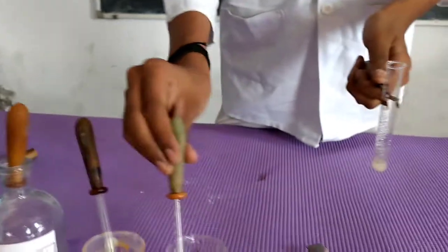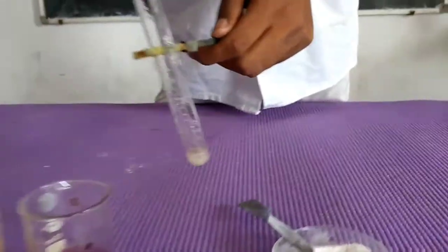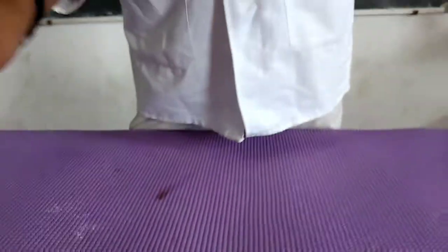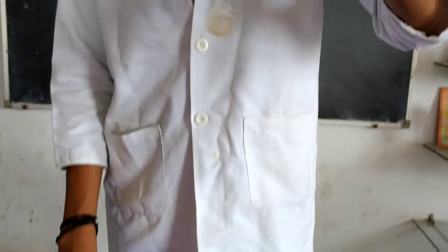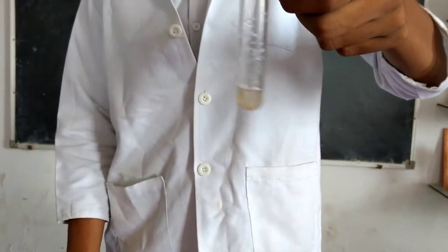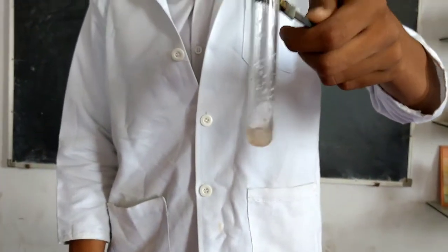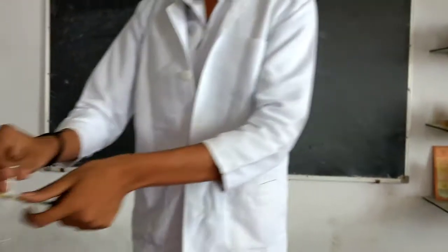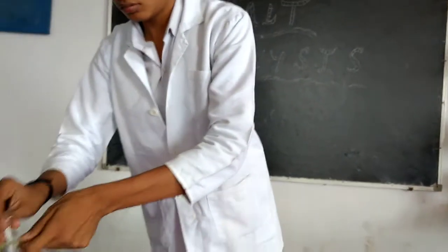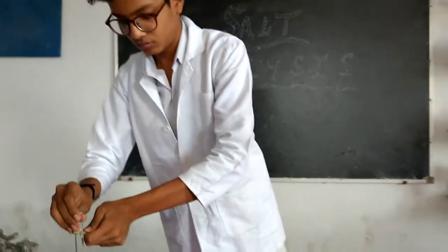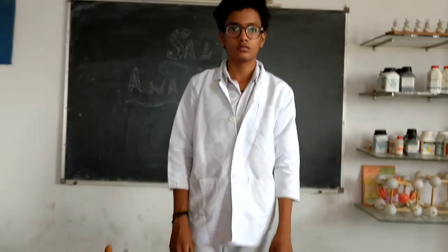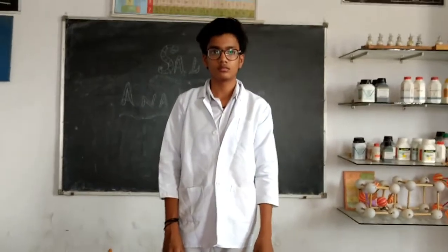In the second test tube, he is adding KMnO₄ solution, whose colour is discharged. So these are the two conformity tests of nitrite ions.